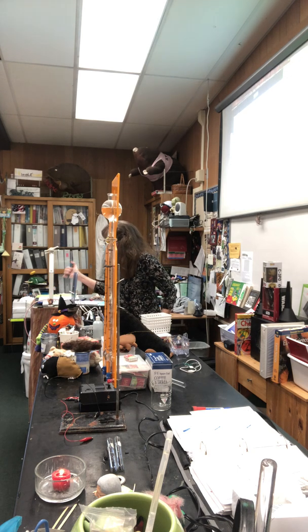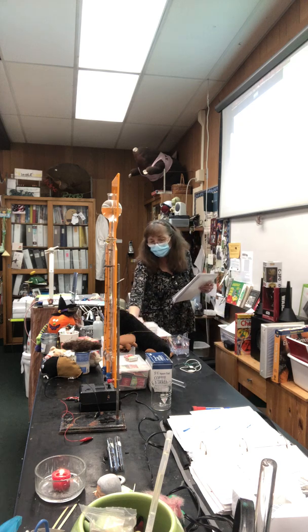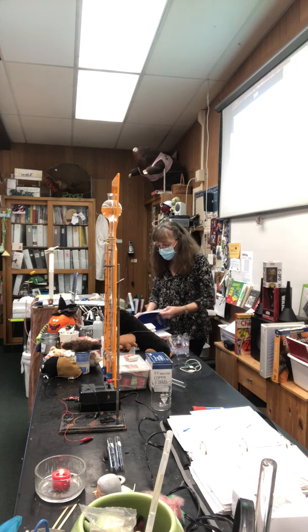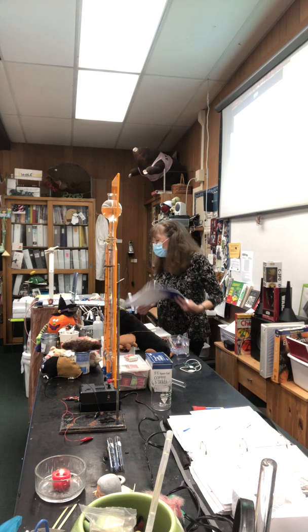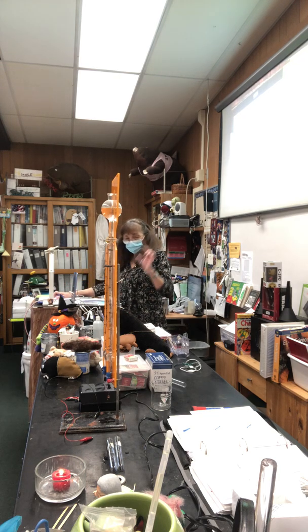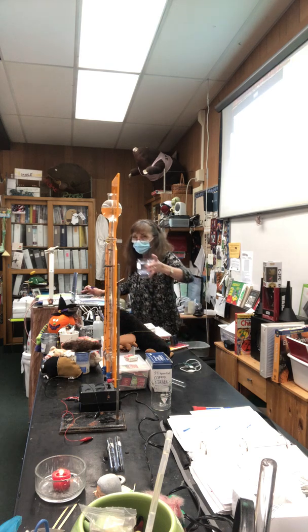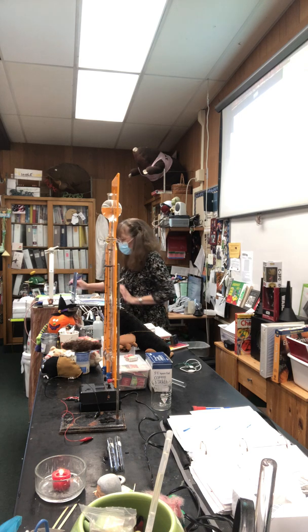So hydro has to do with water, and lysis is still splitting. So we are using electricity to split water molecules into their component elements. And for our lab, for our demonstration, which you're going to do on a little bit smaller scale with a little different apparatus, we're also going to be splitting water using these little tanks and 9-volt batteries. So I showed you these on Friday if you were here. If you weren't, we're going to go through it.